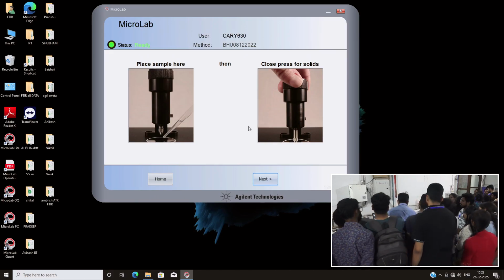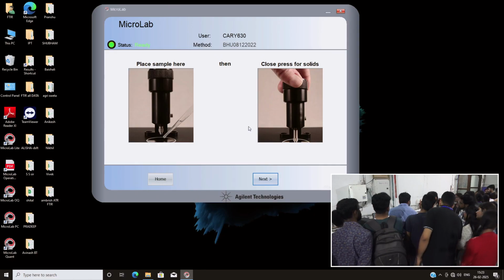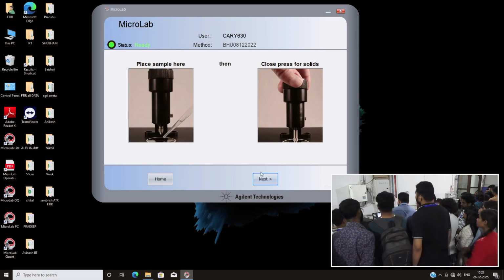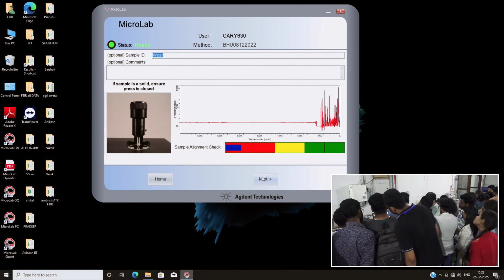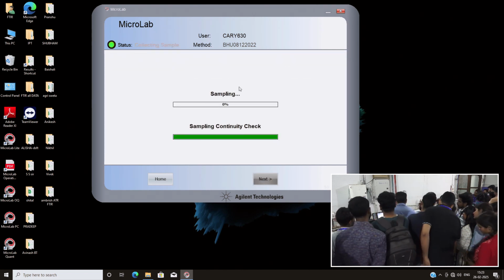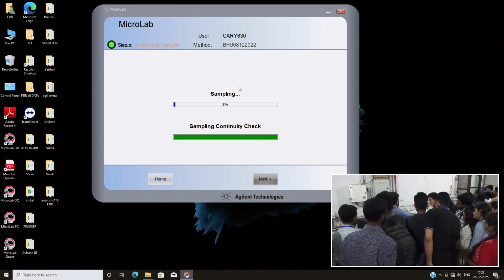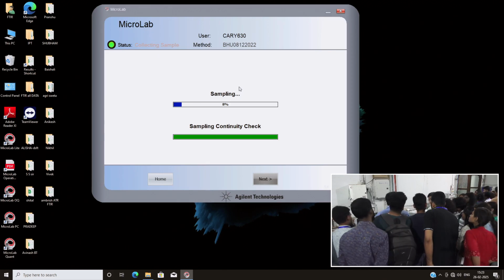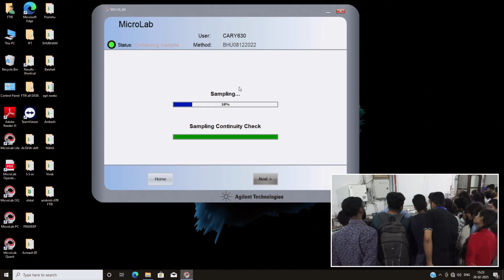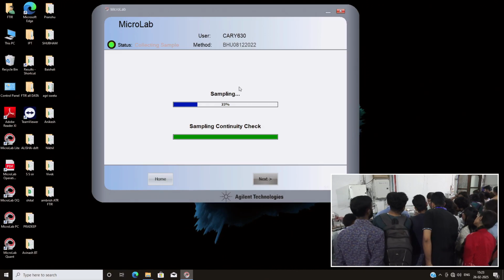You put the sample here during I0 measurement. That time this one is on that side. Let's see what happens. Probably the prism is at the bottom, and this part ensures the attaching of the sample to the prism.